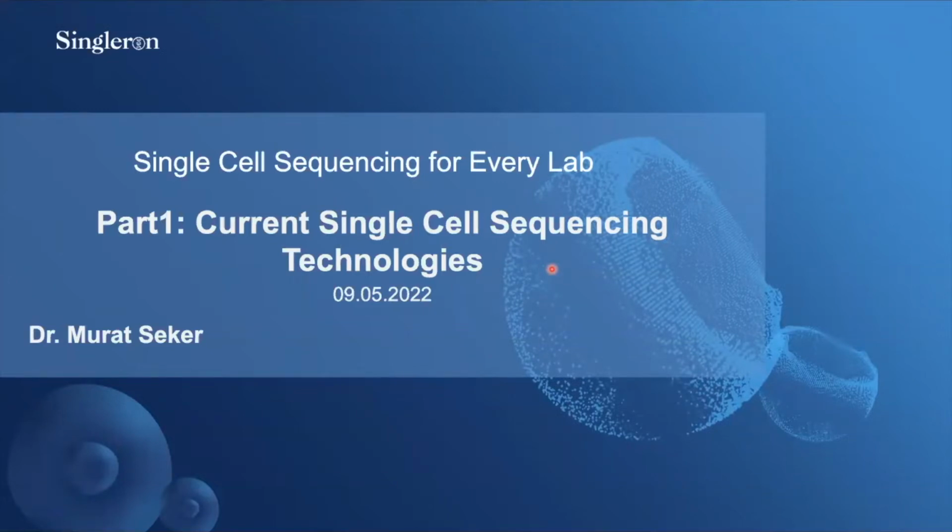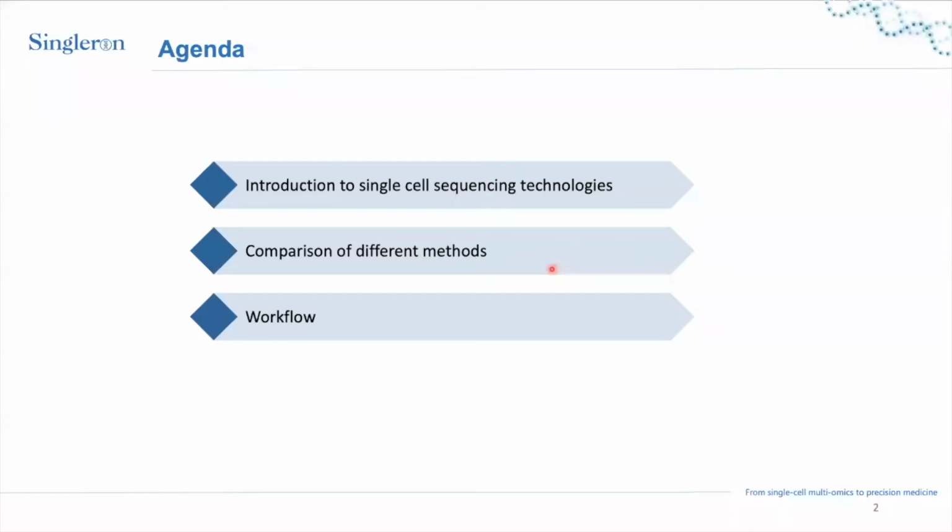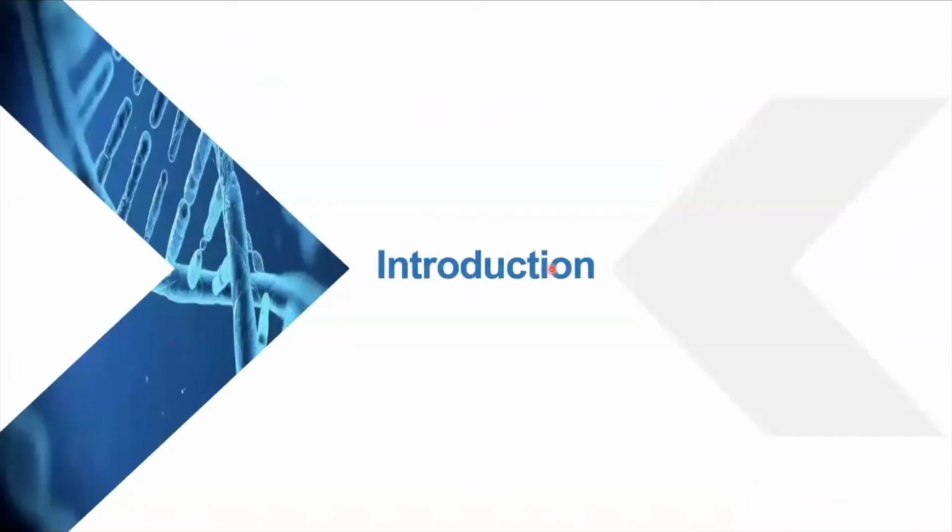Thank you very much for the kind introduction. As Dr. Ayman mentioned, today's agenda will be starting with the introduction of single-cell sequencing technologies. Why do we need single-cell sequencing in the first place? What are the application fields? And I will mention some techniques developed over time. And I will mention the workflow for single-cell RNA sequencing. So let's start with the first one.